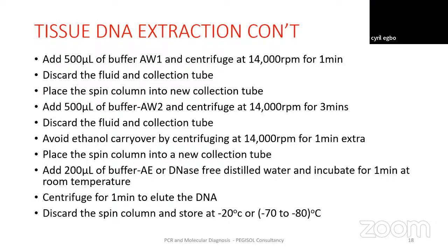In the same way, you can equally extract DNA from hair or any other material that you want to extract DNA from. For example, if you are extracting DNA from hair, you are going to put it in PBS for some time.